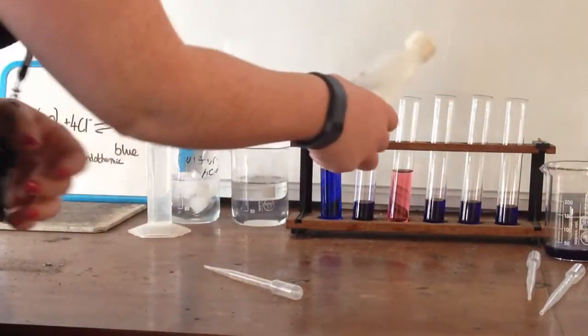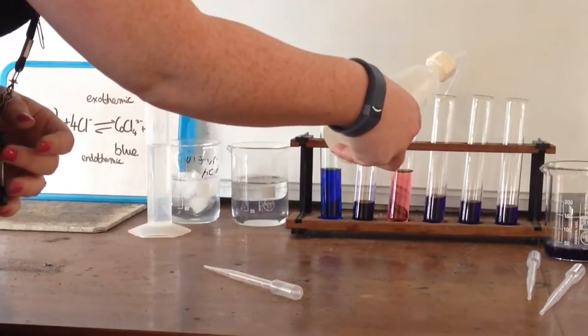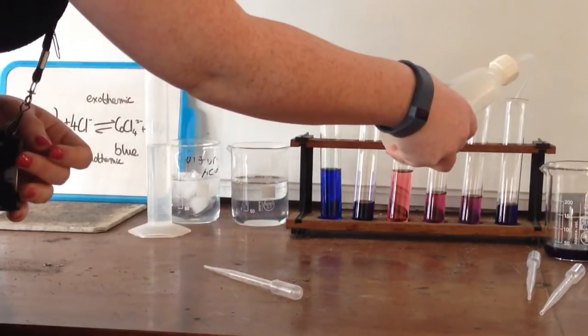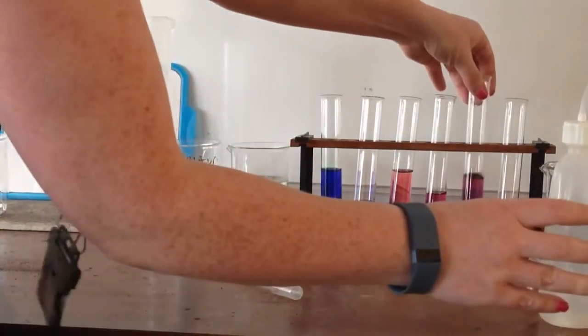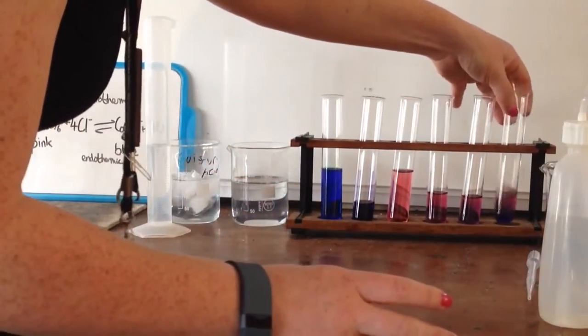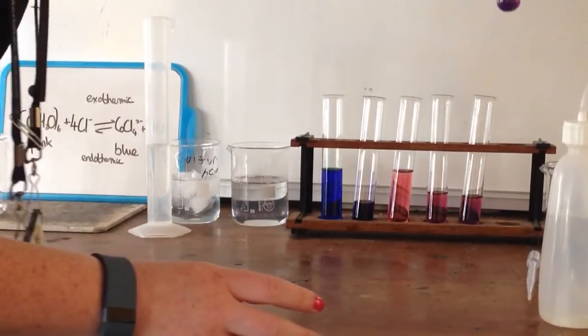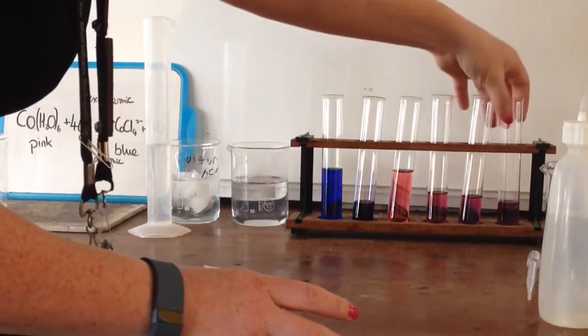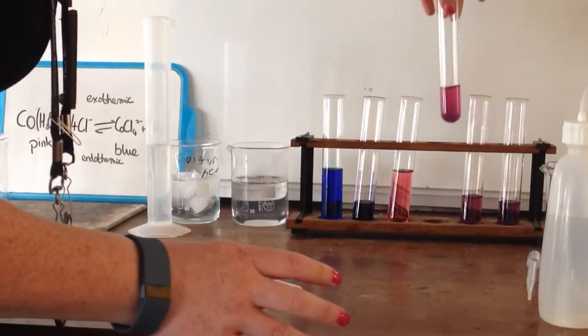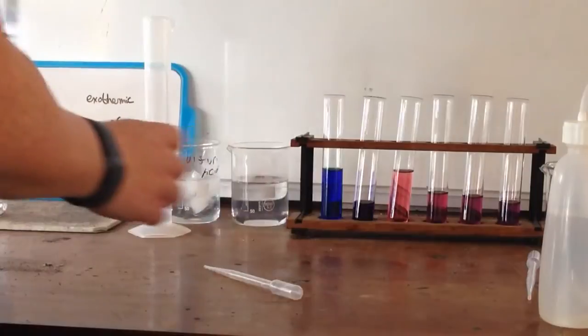So I'm just going to add a bit of water to these three here to get them back to a kind of intermediate stage. So there are violets and not that blue. So you can see this is quite nice violet.